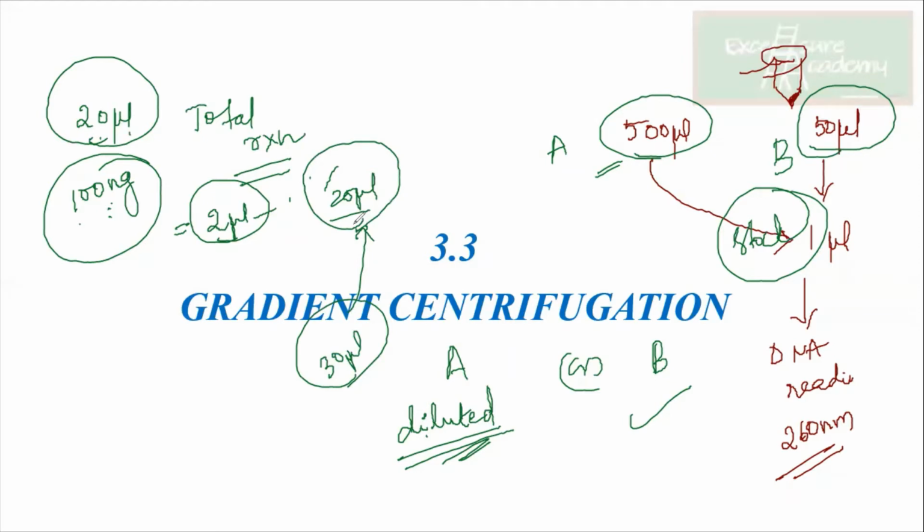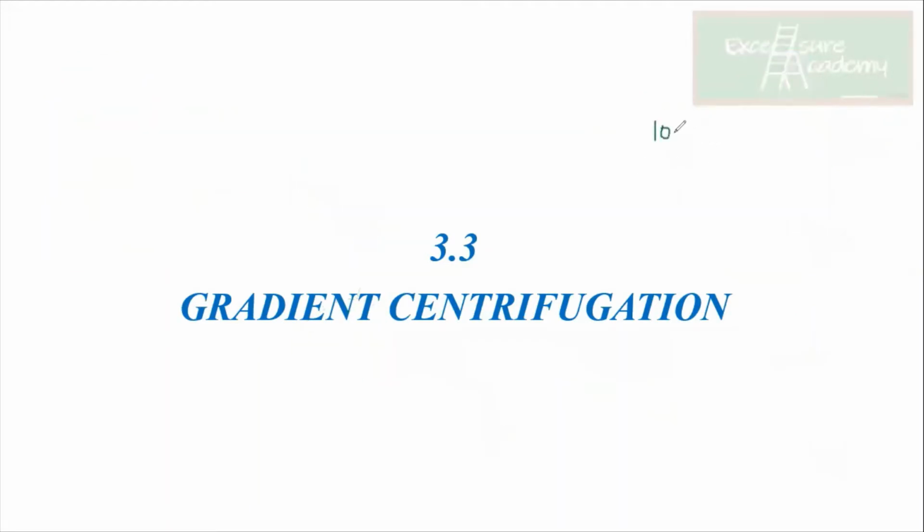Yes, ma'am. Okay, yes, it was simple. So that's why we add less of a DE buffer. Now, see, it's not written on a stone somewhere that it should always be 50 microliter. When you can go for 100 microliter, I'll tell you that also.